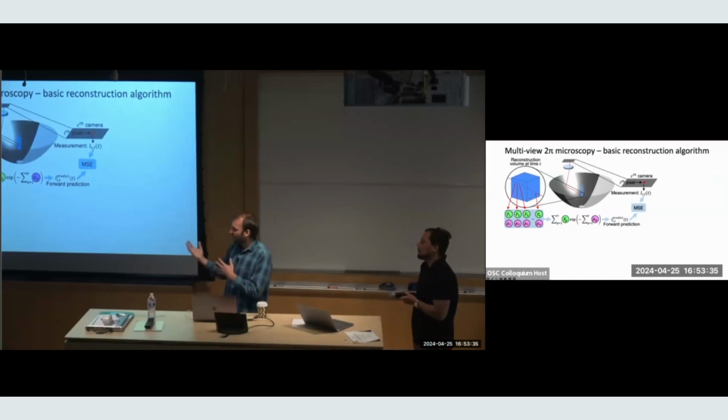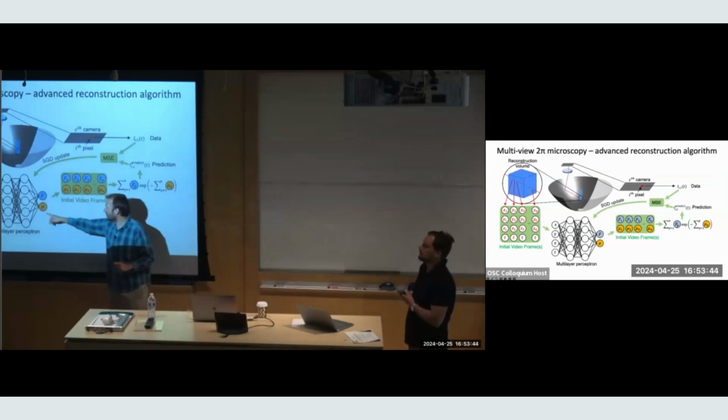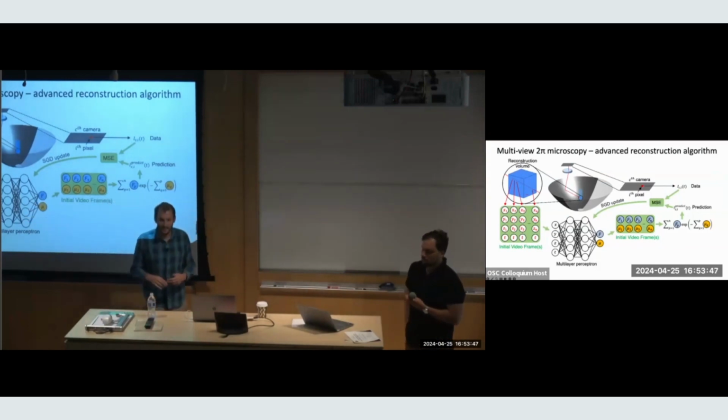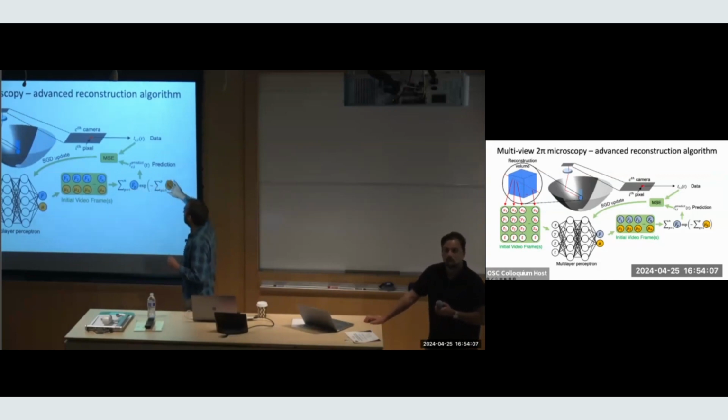In this approach, no, but when we shift to this approach, and we wrote a paper about this in a separate context, the use of an untrained neural network acts as an implicit filter. The reconstructed views matching the camera worked great. But in this approach, the mapping from our volume to our camera measurements is really important. We have to calibrate that. So we have a calibration procedure for this as well.